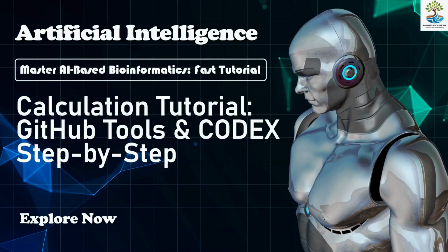If you're still processing NGS and third-generation sequencing data the old-fashioned way, you're losing hours to manual workflows. Today, we're changing that using AI-driven bioinformatics. I'm going to show you how to leverage cutting-edge GitHub tools and Codex to automate your calculations and speed up your pipeline. No fluff, just a fast, practical, step-by-step walkthrough covering the math, the code, and the execution. By the end of this video, you'll have a modern AI pipeline ready to run.